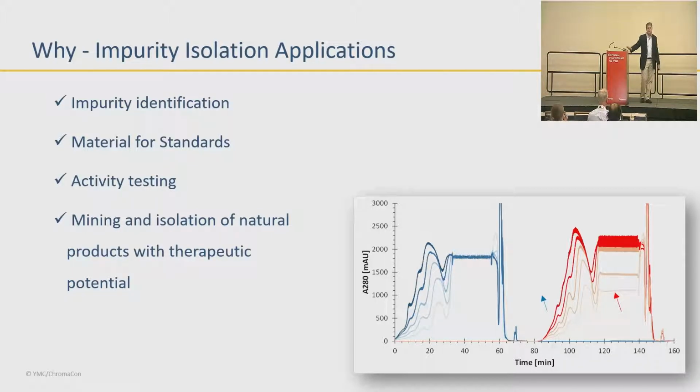The other one is in the natural products world. They believe that some natural product, maybe it's cannabis, maybe it's something else, it's hard to tell, has components that are good for people. This will help you fish out those small impurities.